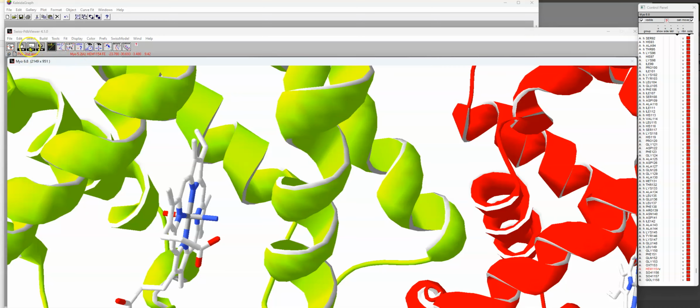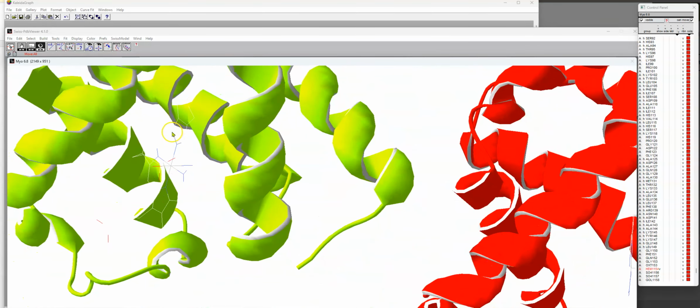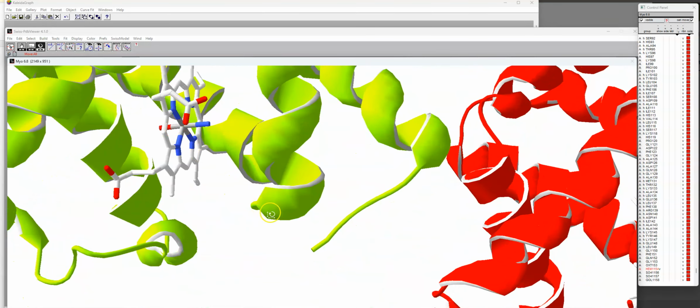Okay, so I'm going to use this rotational thing here to maybe display like the very tip right here. That very tip right there. So, oops, I gotta reselect. So now I made it easy to see. So I'm going to click right here. Got it, and then I'm going to click right here. Didn't like that.